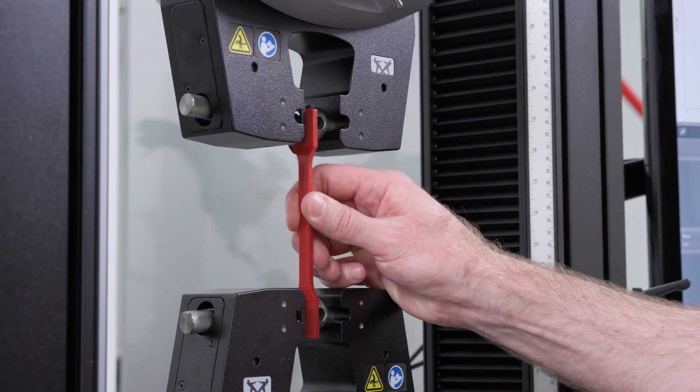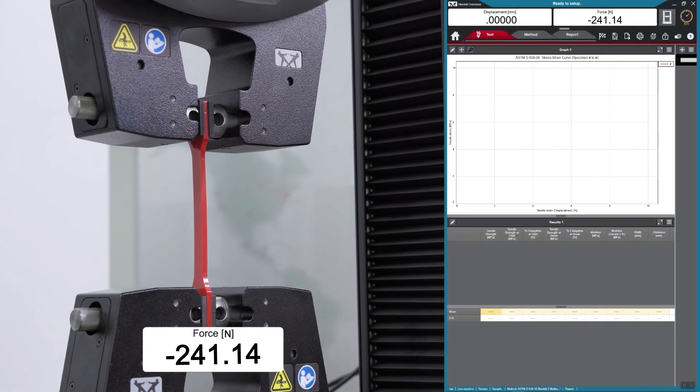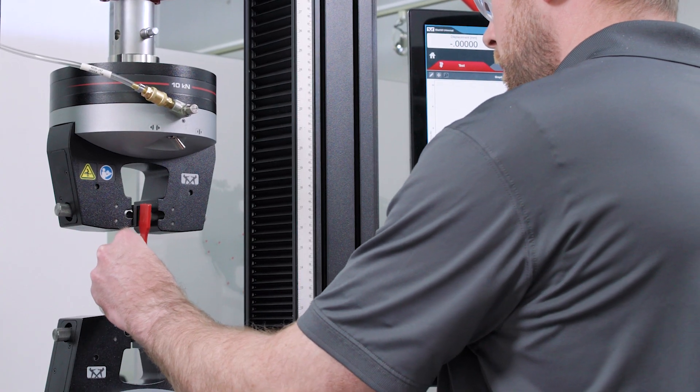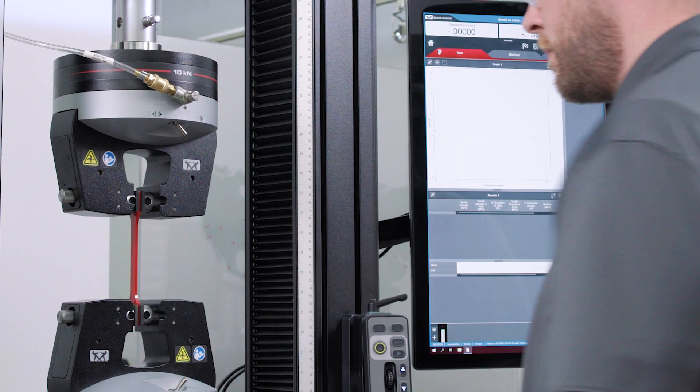Now let's walk through how we use it. For this example, we're going to run a tensile test on some rigid plastic specimens. When I load this specimen into our pneumatic grips, you'll notice that as soon as I close the jaw faces, we're seeing a compressive load of around 300 newtons. With a 6800 system equipped with a Smart Close Air Kit, you'll find that this value is smaller when using a lower initial gripping pressure.